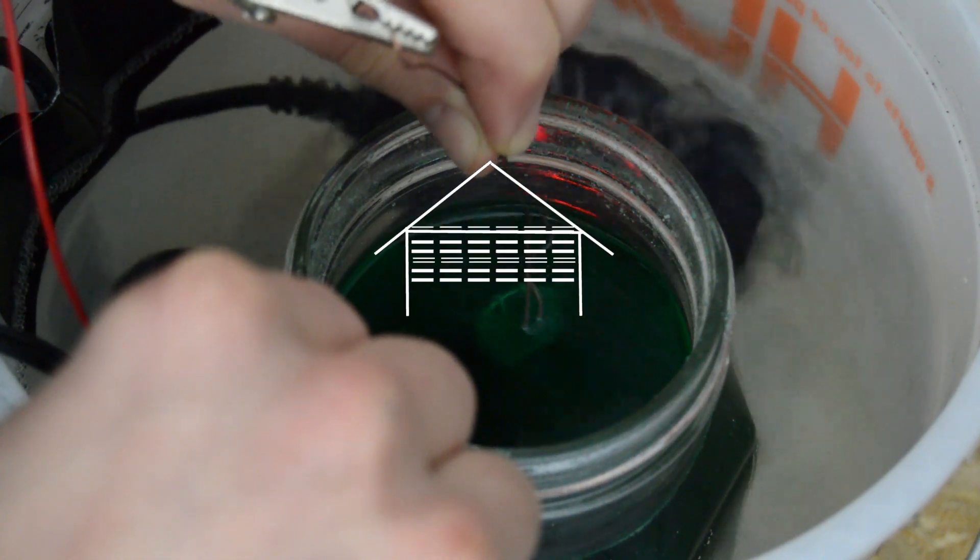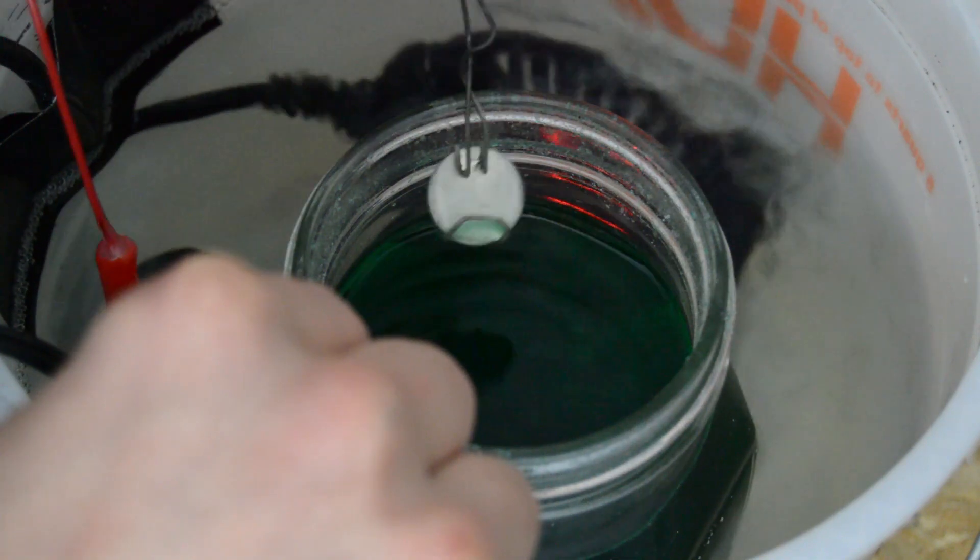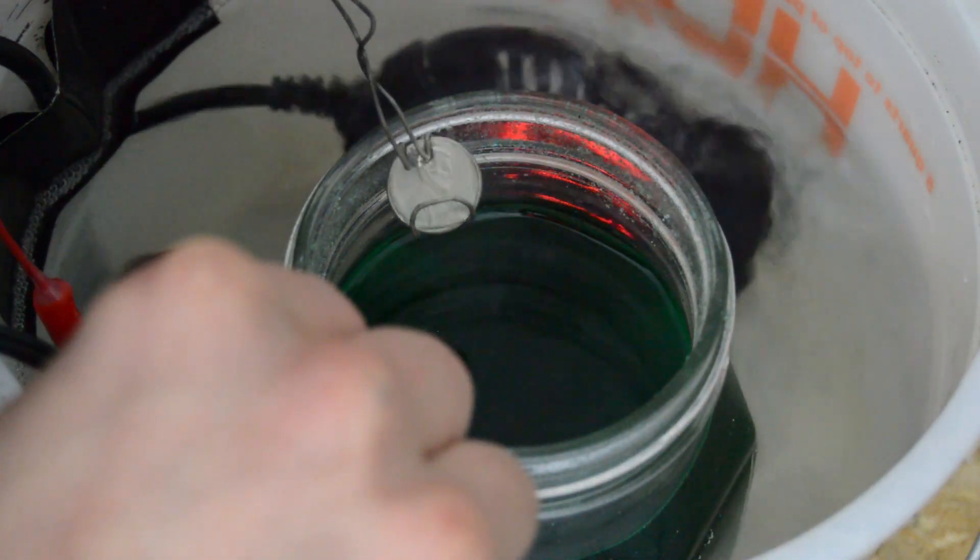Hello again and welcome to another installment of Garage Science. This time I'll be showing you how to make a simple yet effective nickel plating solution with only a handful of ingredients.